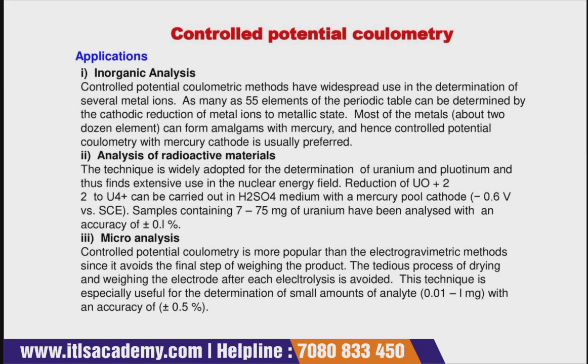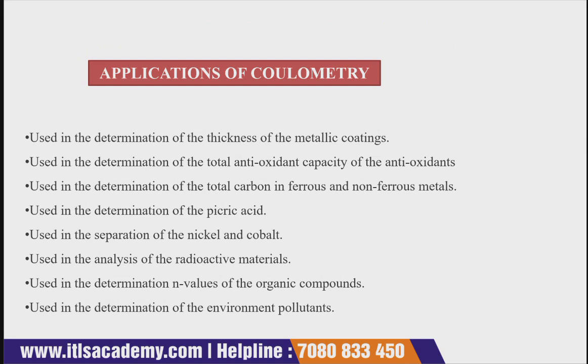Then in microanalysis, when you want to analyze any particular substance at the micro level, this technique is used. Further, it is used in determination of the thickness of metallic coating. If you want to check the thickness of a metallic coating, you can use this technique.